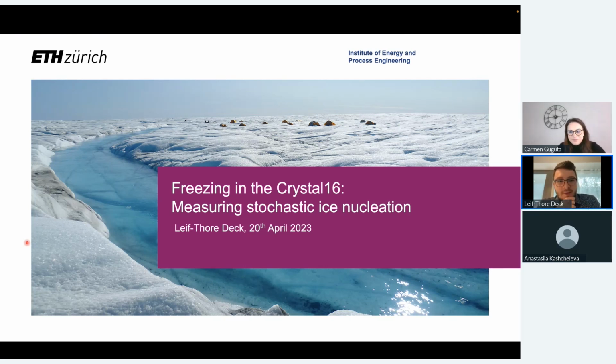As Carmen said, I would like to talk about freezing in the Crystal16. If you remember the list of applications that Carmen showed before, freezing was actually not on the list of what this device is commonly used for. As far as we know, we are the first group to use the Crystal16 to do freezing measurements. I think it's a very nice new application of this device that I would like to discuss a bit more specifically today. I would like to focus on the measurement of stochastic ice nucleation.